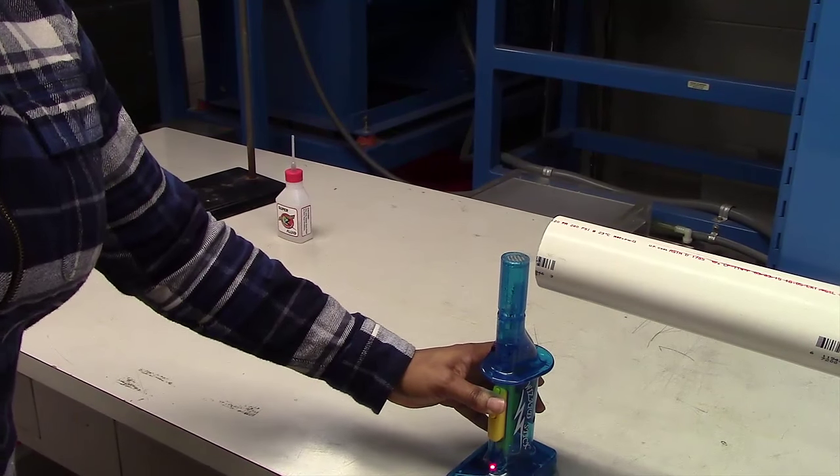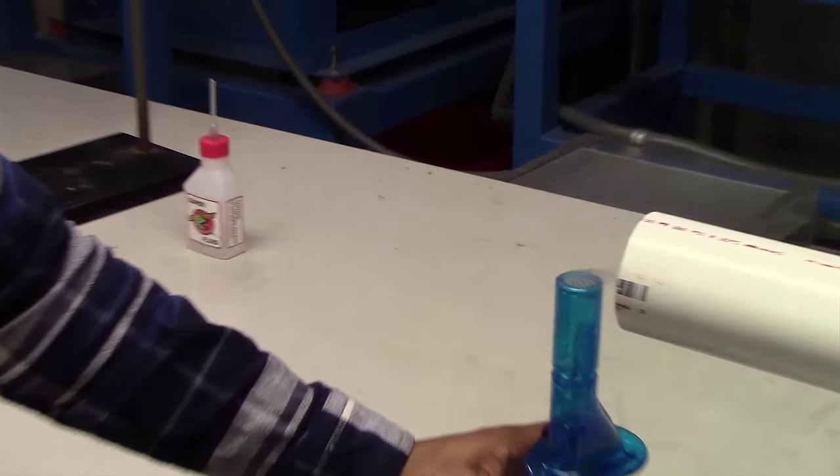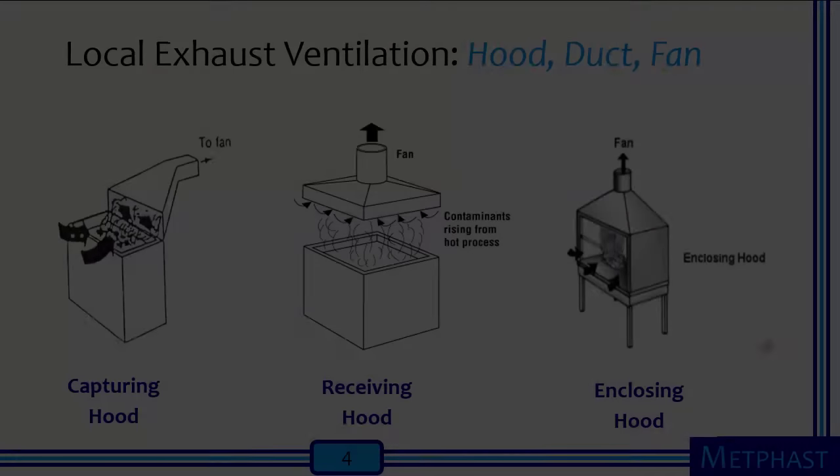We see here that the capture of the fog will improve as the source gets closer to the hood. When the hood is too far, competing air currents in the room will reduce the ability of the hood to capture the fog from the source — in this case, the wizard stick. Therefore, a capturing hood is effective as long as the distance from the source to the hood is very close.